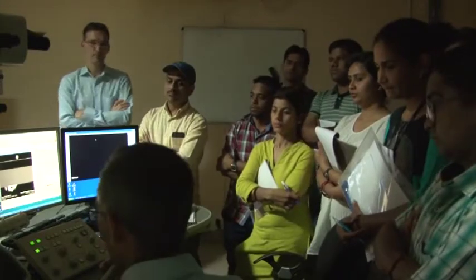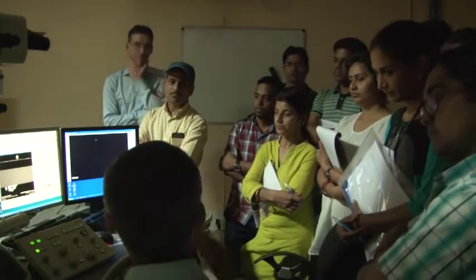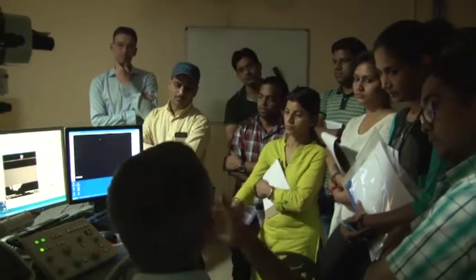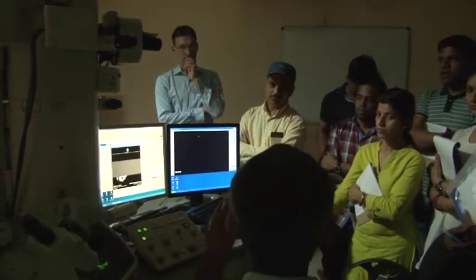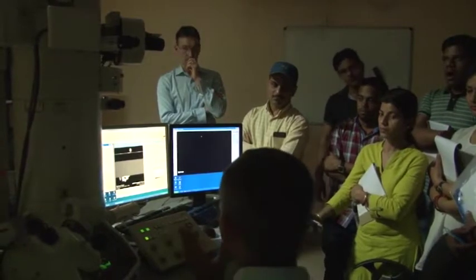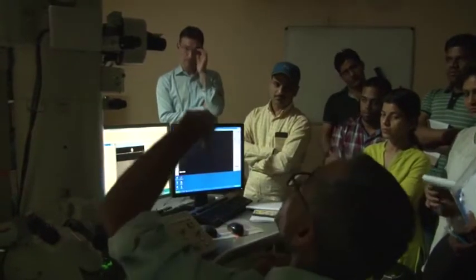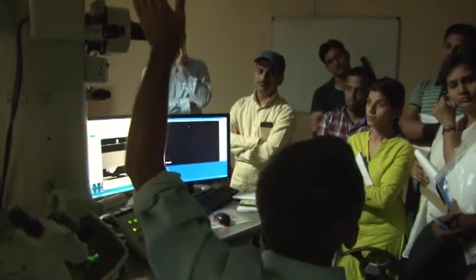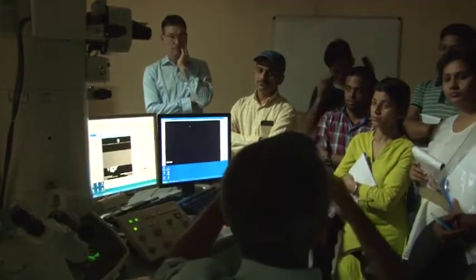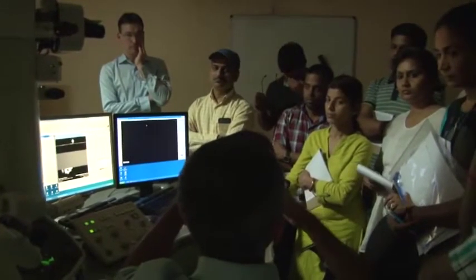Okay, so now for the other alignments, let's say the objective lens centering using voltage centering. In voltage centering, they change the voltage that is supplied to the microscope by some amount, maybe plus minus 10 volts or whatever.